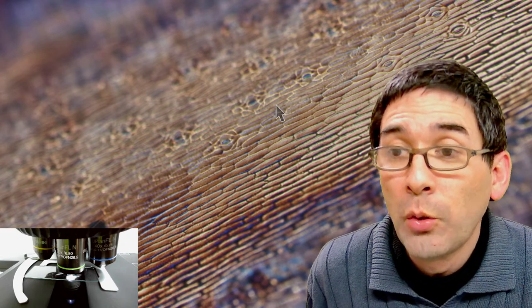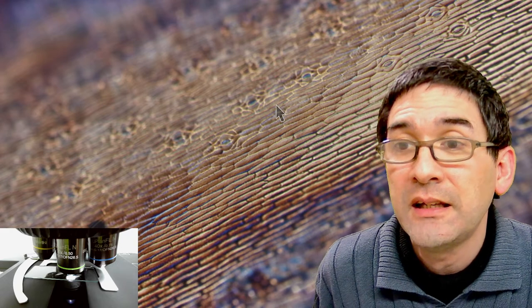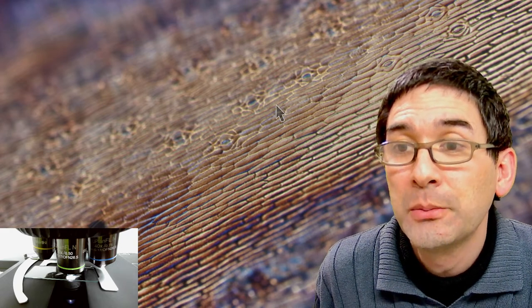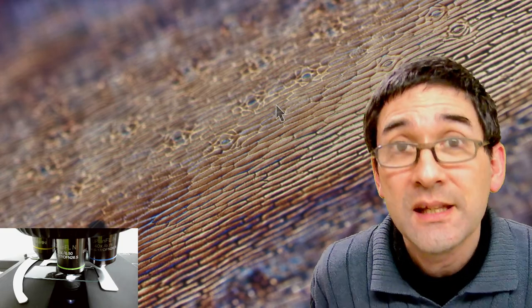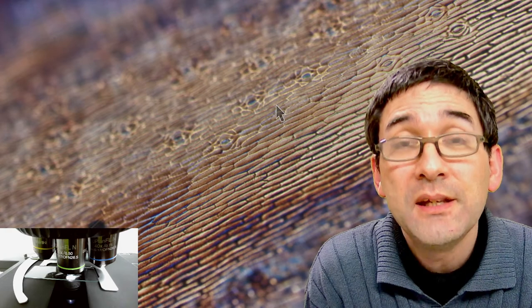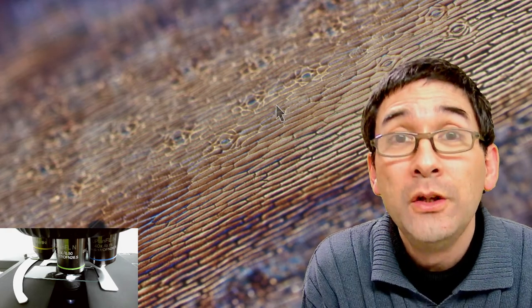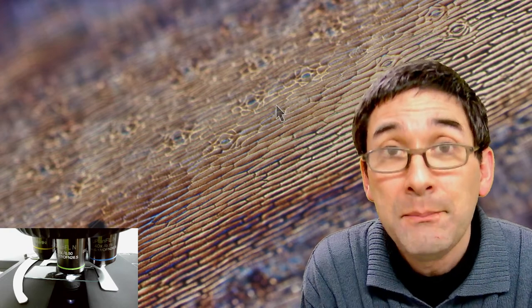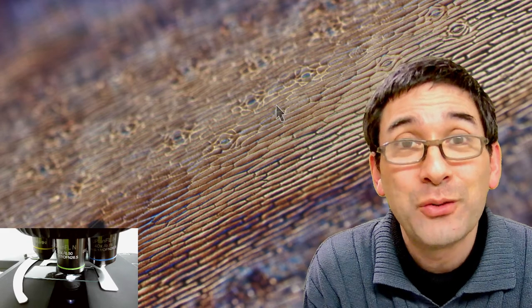My microscope is binocular, so it doesn't have a dedicated camera port. Is it still possible to use a camera? Yes — what you do is, instead of one of the eyepieces, you put in a microscope camera. Or you put a mobile phone over one of the eyepieces. So yes, you can do photography and video even if you do not have a trinocular port. It's not quite as convenient, but it's quite well possible.